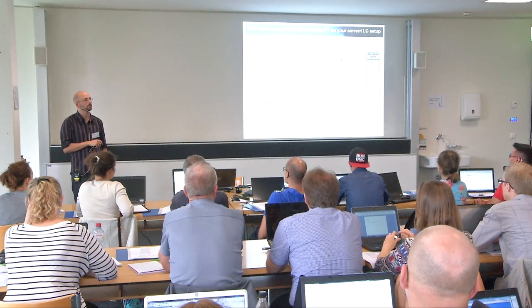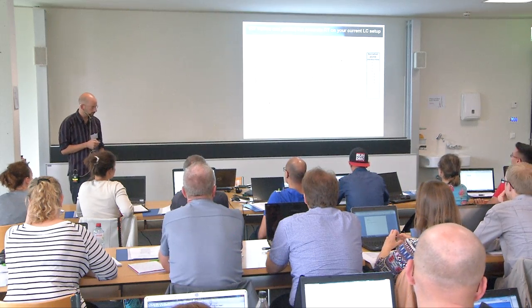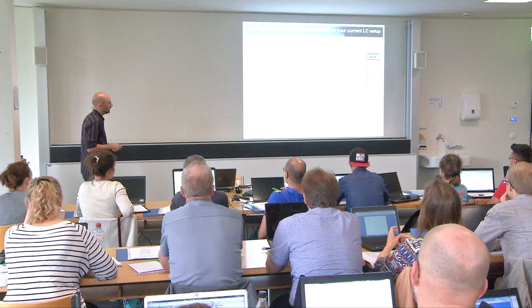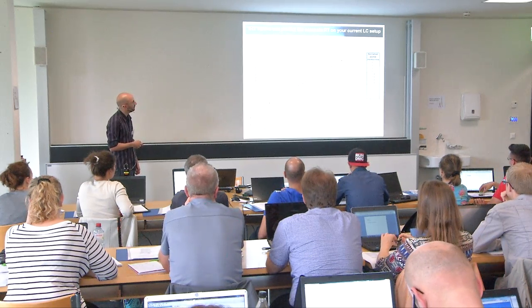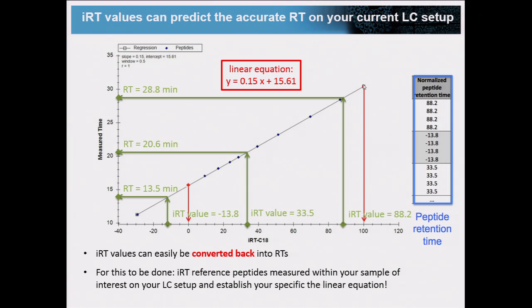Any more questions on this? So just to reiterate, here we had a case where we had IRT values and we converted them back into retention times, and these are basically predicted retention times. We can go and measure them, and see if this is exactly the same, or how good the prediction was, etc.